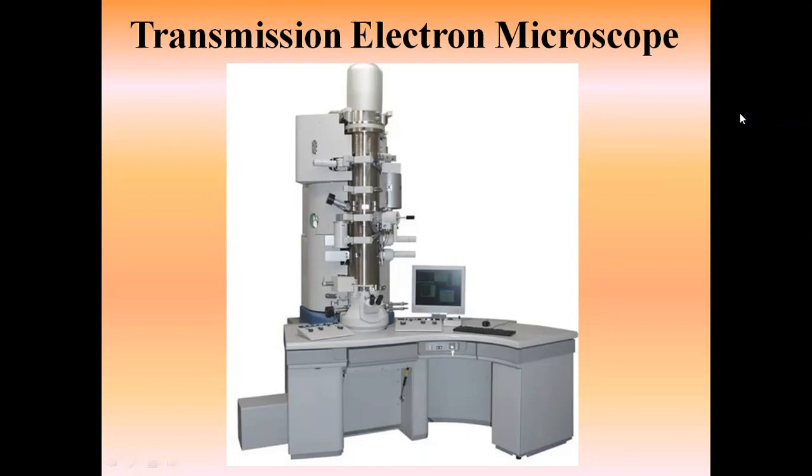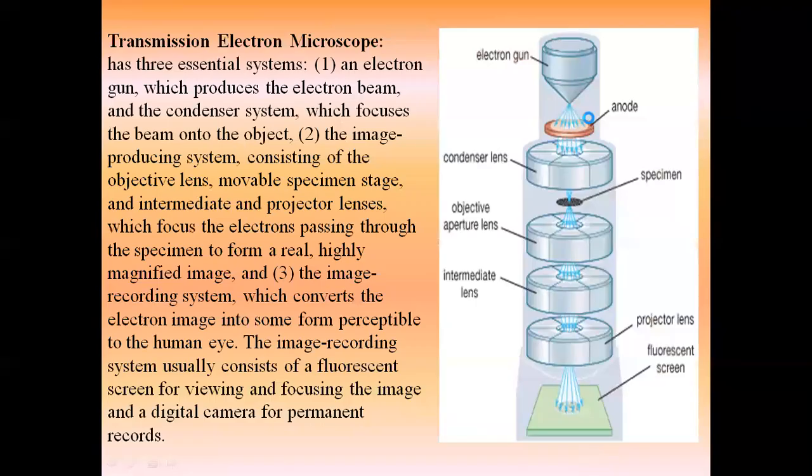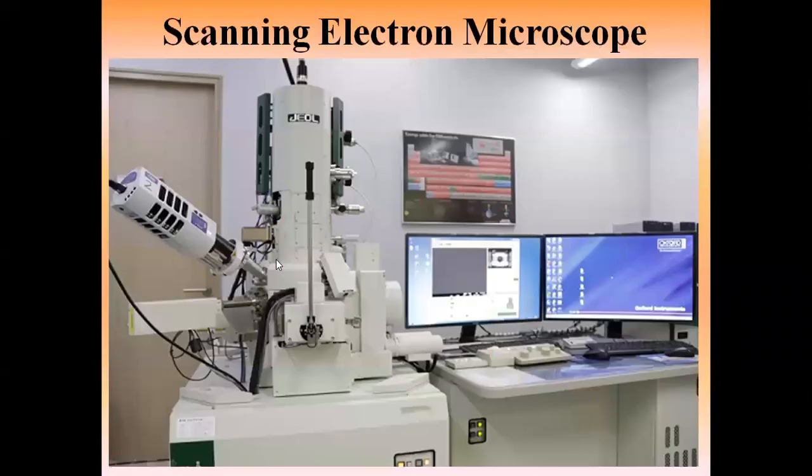This is your general picture of the transmission electron microscope. Then you have the setup of your scanning electron microscope. So what are these parts, what is inside, how is it made? That we will come to see.